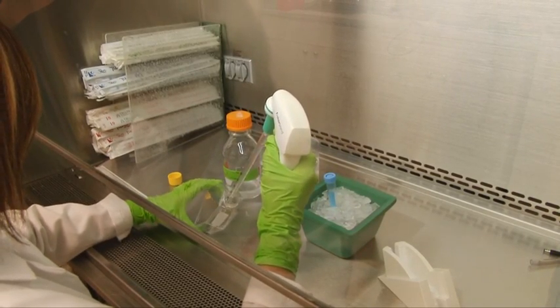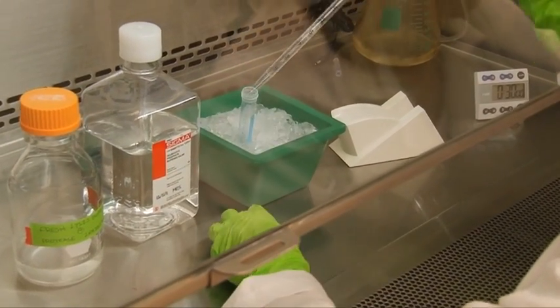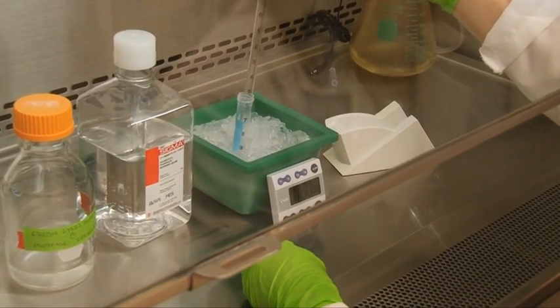It is very important to include protease inhibitors in your lysis buffer, which will prevent degradation of your sample. Always use freshly prepared protease inhibitors, keep samples on ice, and work quickly.